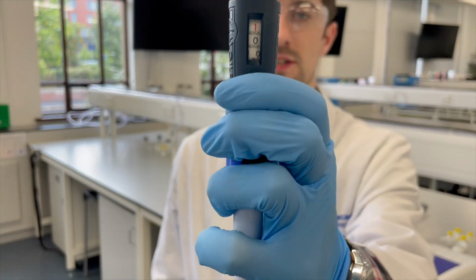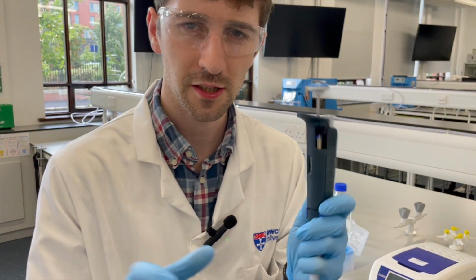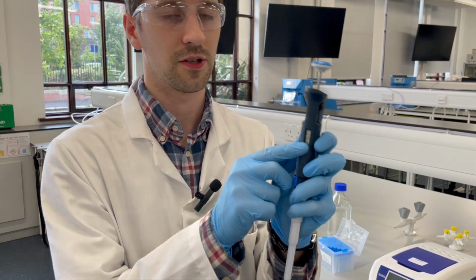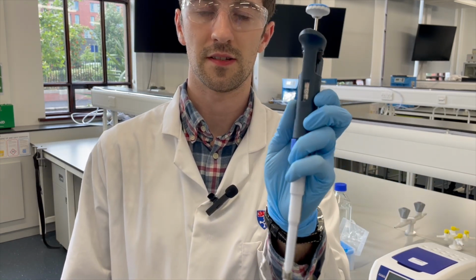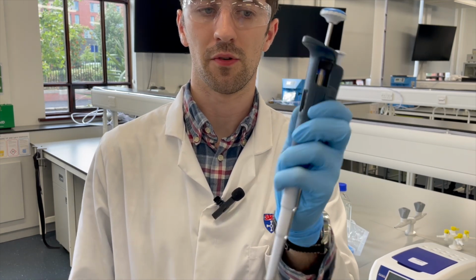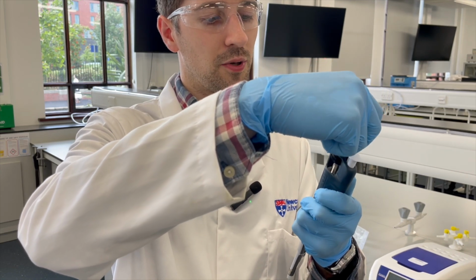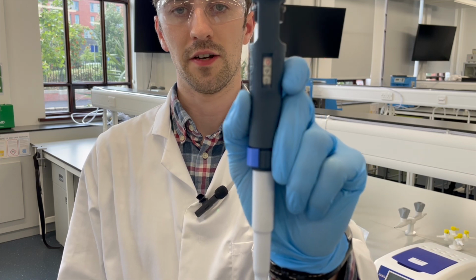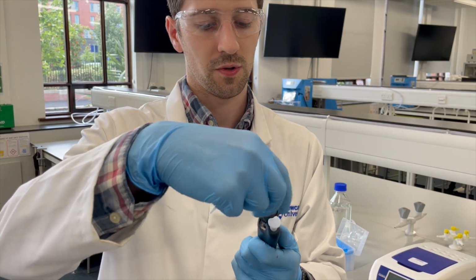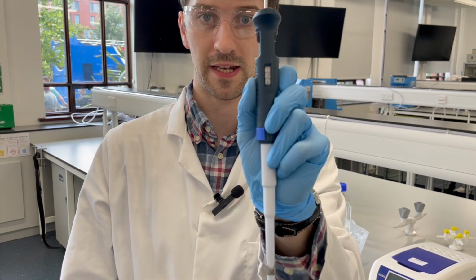Instead, their number system only has 3 numbers. It's sometimes a little bit confusing for those that haven't seen it for the first time, but for these types of pipettes, this is set: the 1 is the maximum value, and it's set at 1,000. Of course, if I just tune this down, let's say we put it at 900 microliters, you can see that now it says 0 at the top, and that's what we're using to guide ourselves in terms of the volume that this pipette is set to.